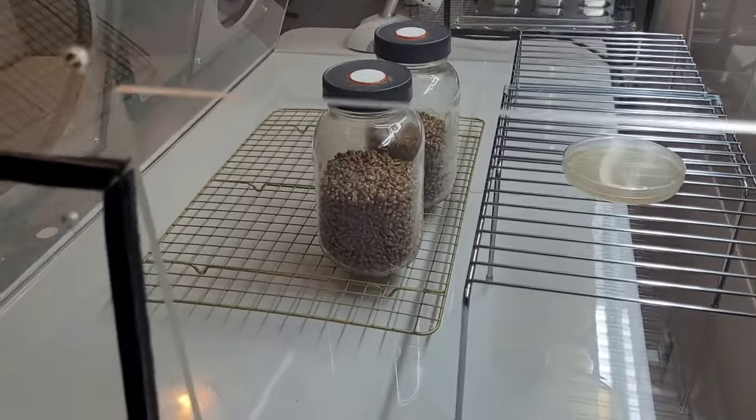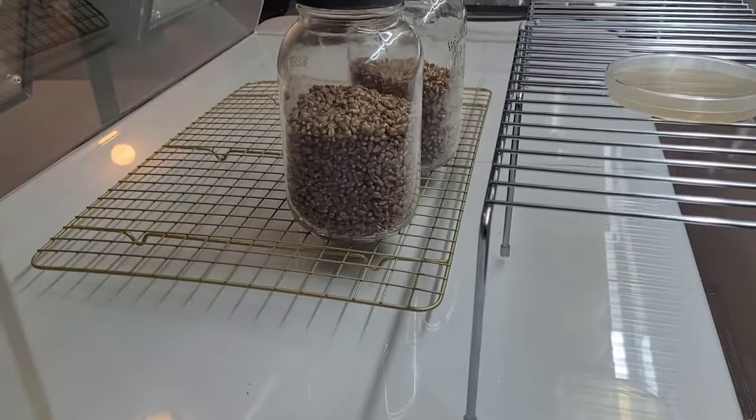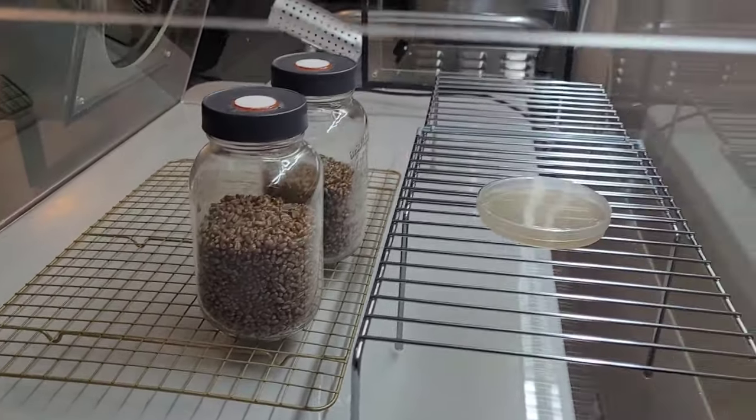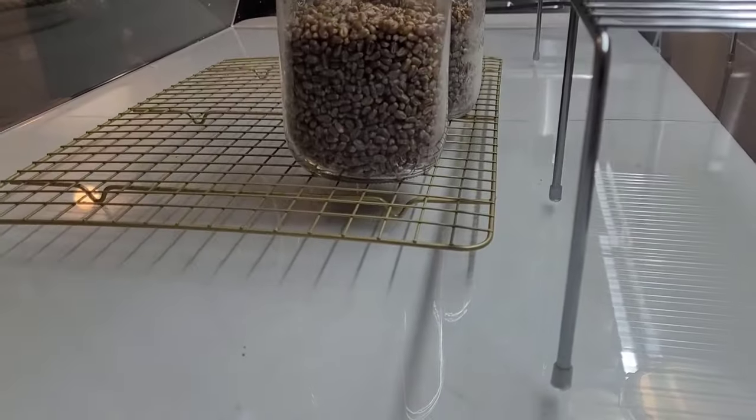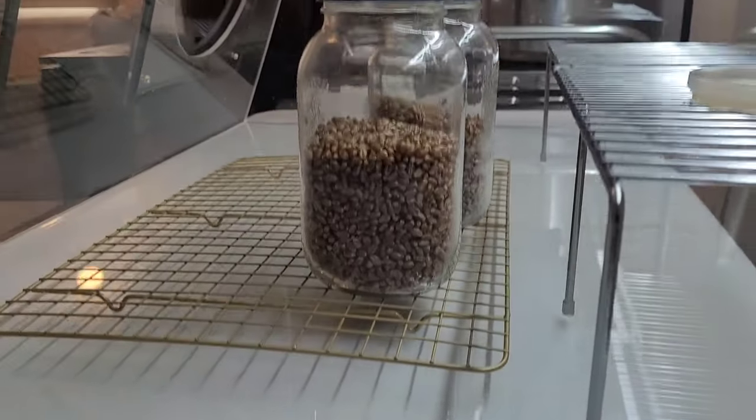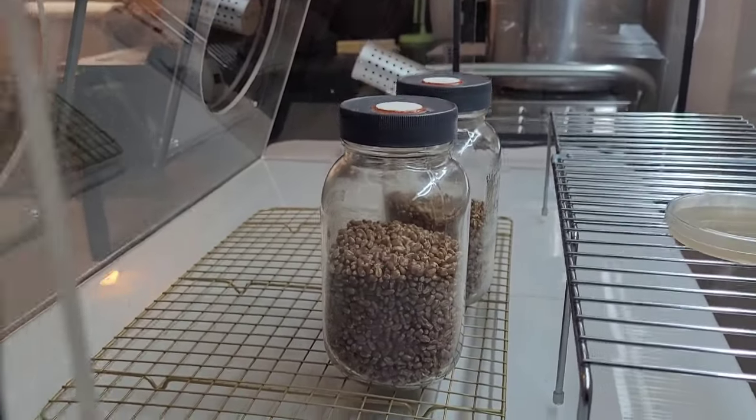When loading your still air box, ensure that you have at least one kind of rack. I suggest two. You'll see I have two different heights of rack here. This smaller or shorter cookie rack is to elevate my jars off of the floor of the still air box.